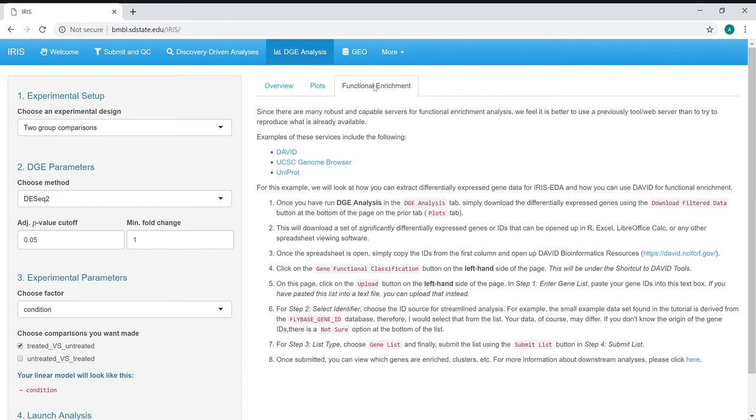What you can also do here, while we didn't integrate it within the server itself, there's plenty of servers out there and plenty of tools that do satisfactory jobs of functional enrichment. So what we have here is an introduction into how you can use any of these tools for the analysis related to this server.